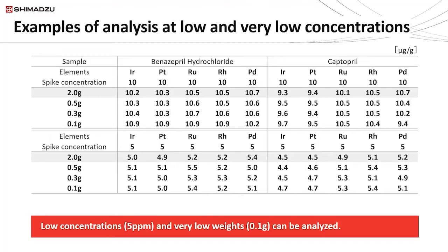And you can see that regardless of the sample volume, there's no rate of change, first of all. There's no systematic rate of change. And the recovery is, for lack of better words, rather high.